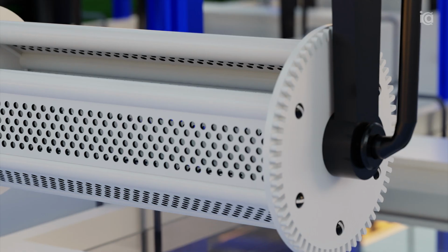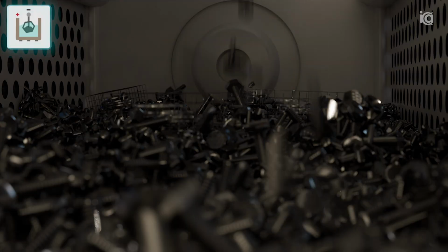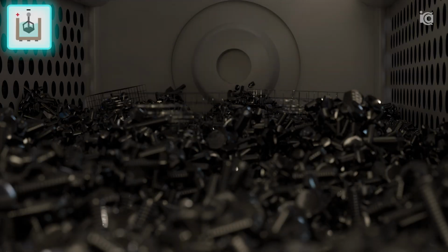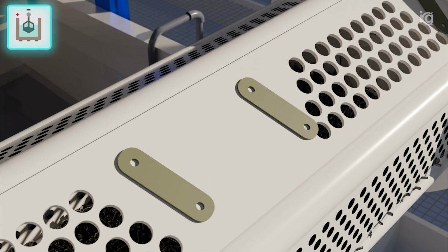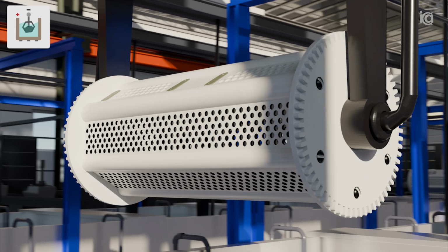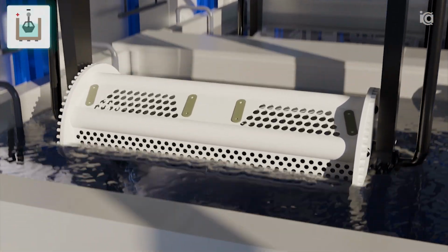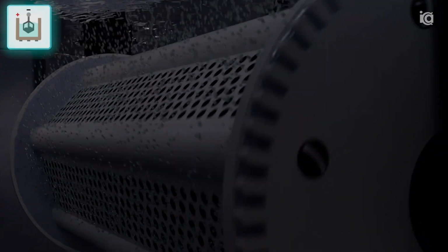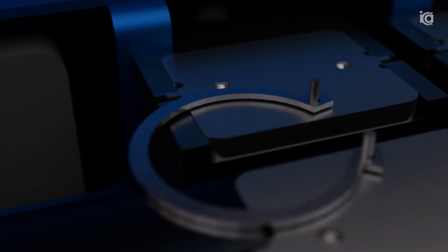Hydrogen-induced material embrittlement occurs due to hydrogen entry, for example during pre-treatment processes. Operations such as pickling or coating generate a production-related supply of hydrogen which can diffuse into the material. The hydrogen dissolved in the material can later lead to critical material failure during operation. To reliably detect hydrogen embrittlement, tension testing is sensible as well.